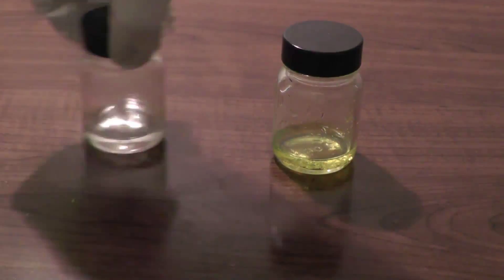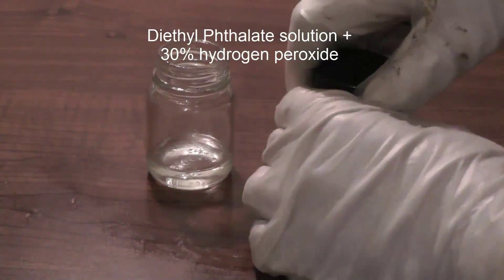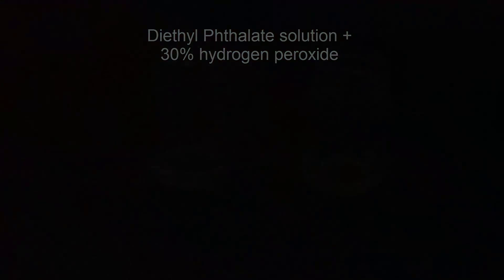To start the glow, take some 30% hydrogen peroxide. Now turn off the lights and mix them.